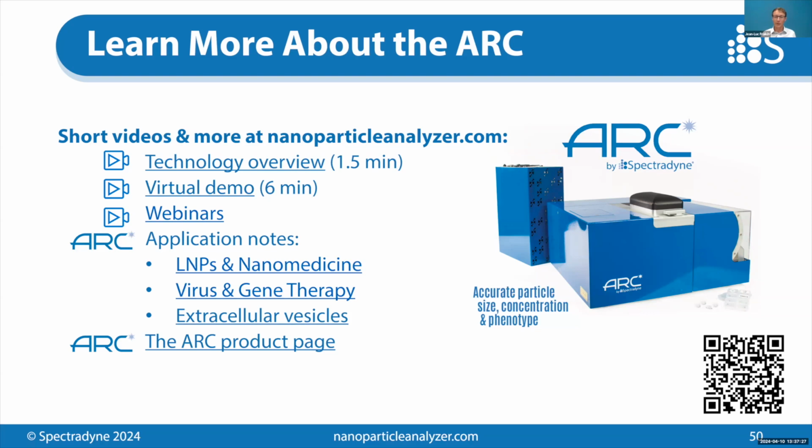All right. Next question. How would you determine the RNA encapsulation efficiency in the ARC? It seems like the analysis gives you the proportion of LNP loaded versus empty instead of the total RNA amount encapsulated. Okay, that's a very good question.